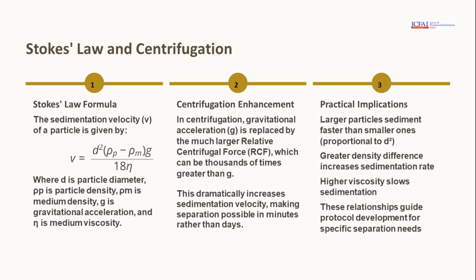By replacing gravitational acceleration with the much larger relative centrifugal force, centrifugation dramatically increases sedimentation velocity, making separation possible in minutes rather than days. These principles guide protocol development for specific separation needs.